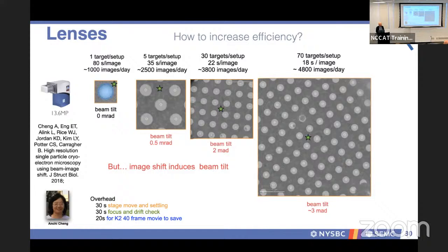And that can now be corrected not only in software, but hardware. There's a calibration matrix that we can use to minimize not only coma, but also stigmation and defocus introduced by that. Because if you're on axis, that's a particular path. When you start to image shift, that's a different path. It's actually going to get longer and longer.